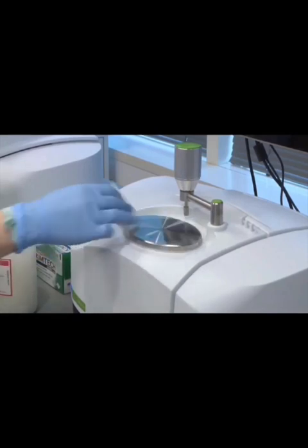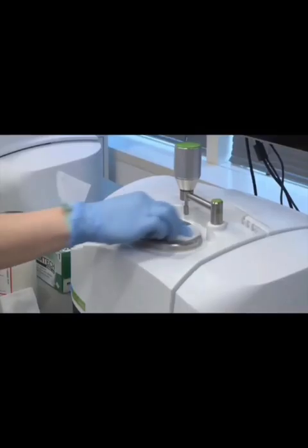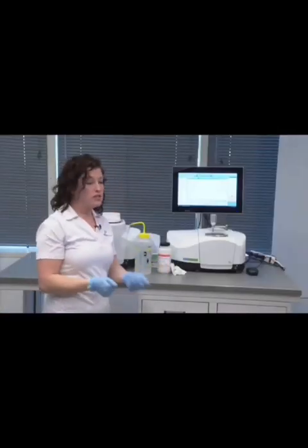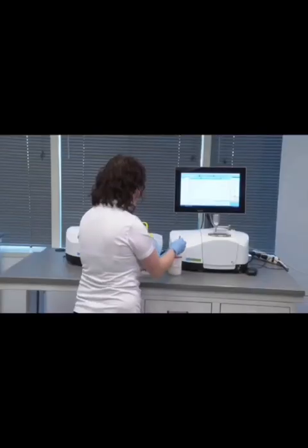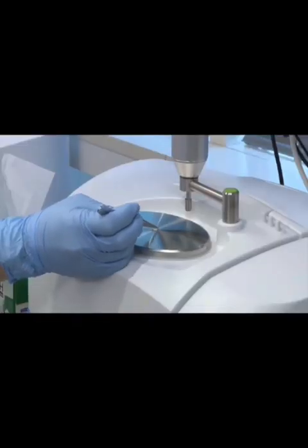Make sure the sample covers the whole surface of the crystal at the sample base when applying the sample. The sample needs to be pulverized so that the FTIR machine can analyze the sample better and produce a consistent wave number from the result.